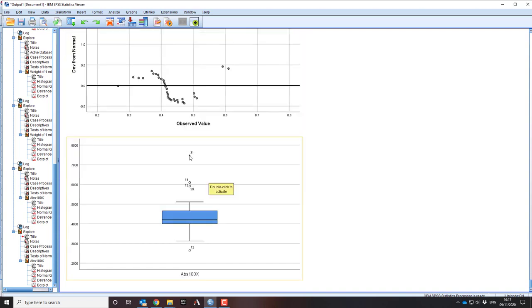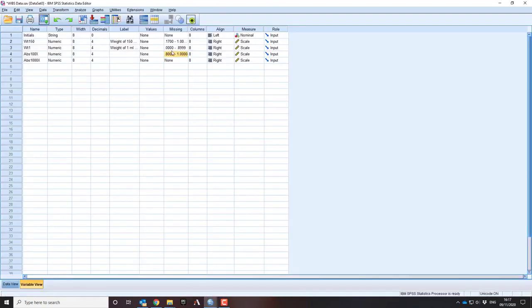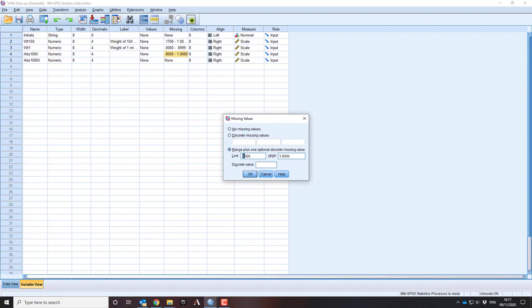So I got rid of 0.38, but I didn't get rid of 31. So actually I want to probably put the boundary for the top end at 0.65 and see if that will get me to where I need to be. So I go back to my data, tweak my absorbance, so down from 0.8 to 0.65.